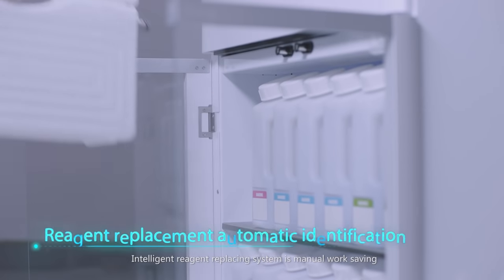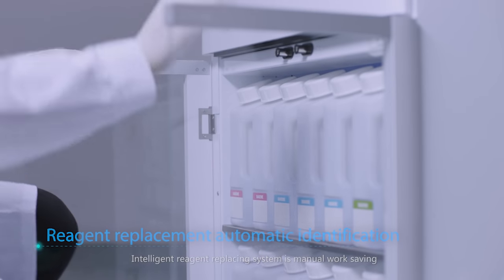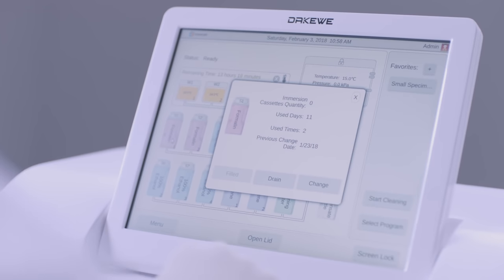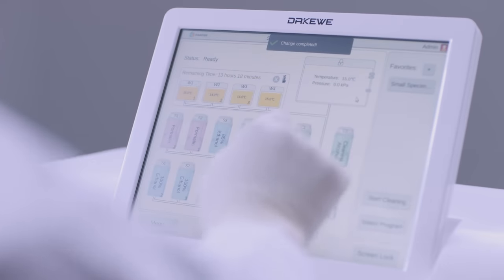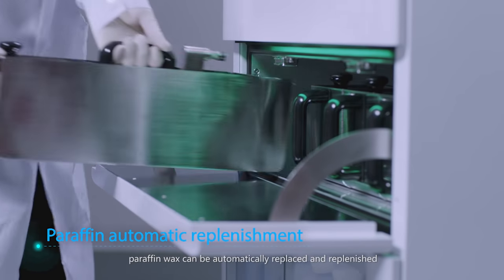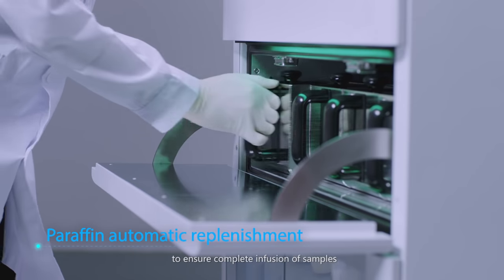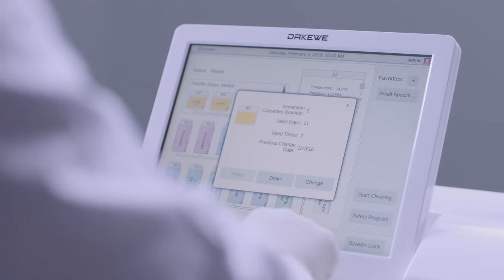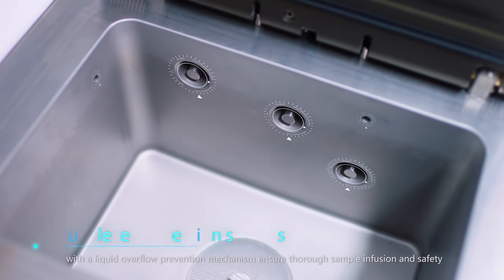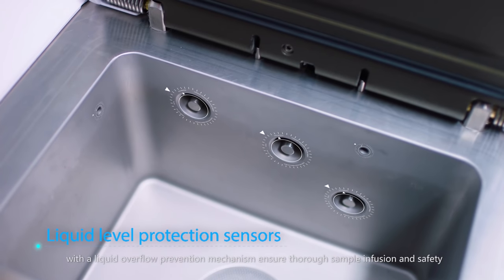The intelligent reagent replacement system is manual-work-saving. Paraffin wax can be automatically replaced and replenished to ensure complete infusion of samples. A five-point liquid level monitoring system with a liquid overflow prevention mechanism ensures thorough sample infusion and safety.